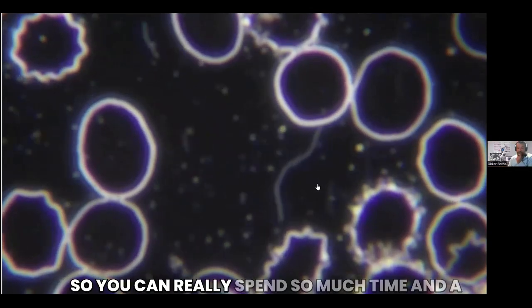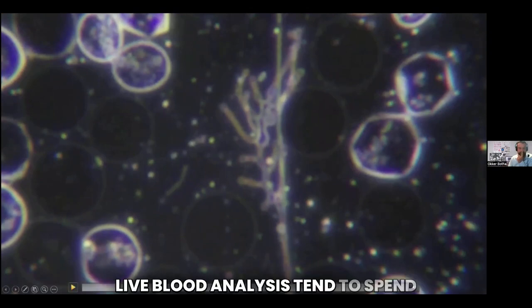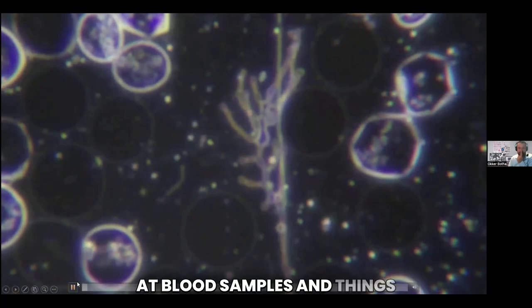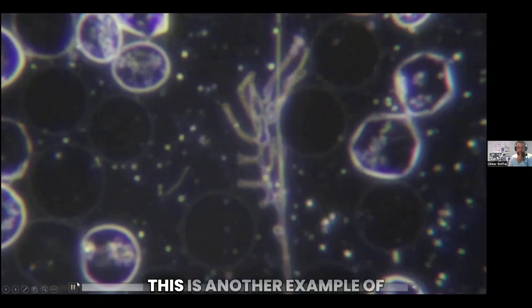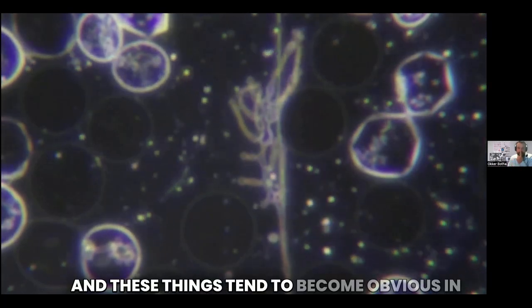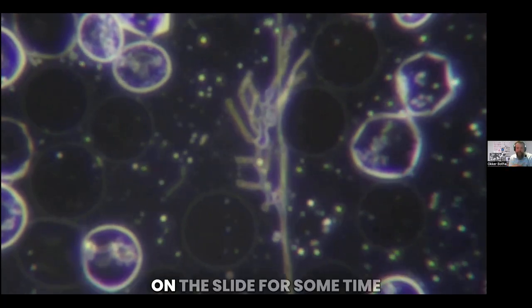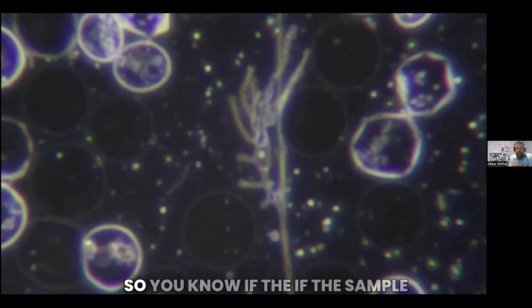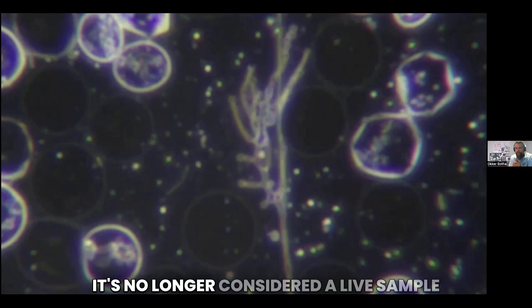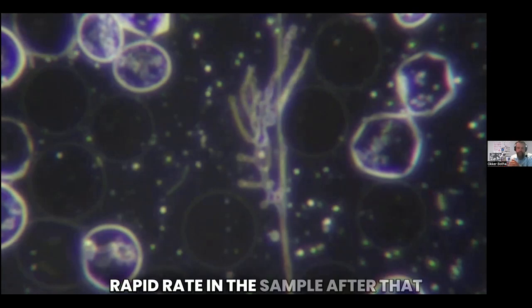So you can really spend so much time, and a lot of people, when they start working with live blood analysis, tend to spend many hours behind the microscope, looking at blood samples and things taking place in the blood. This is another example of a cell wall deficient bacteria, and these things tend to become obvious in samples when the blood cells have been standing on the slide for some time. If the sample has been standing after about 20-30 minutes, it's no longer considered a live sample, and things start changing at quite a rapid rate after that.